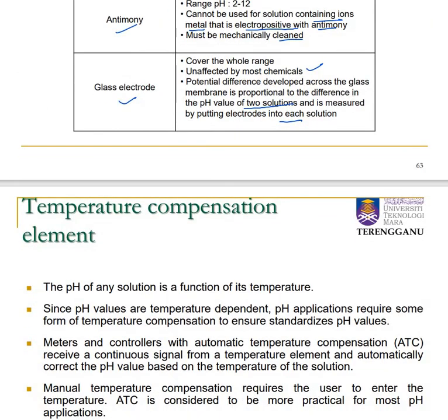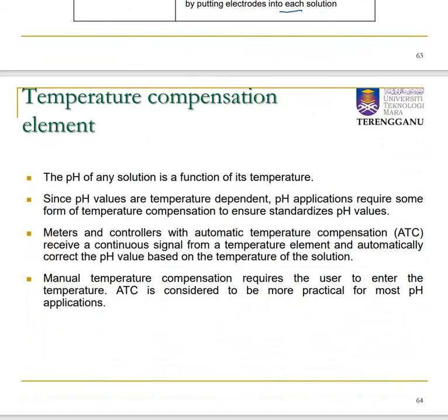Okay, with the other type of pH device, we can use a temperature compensation element. For your information, pH is a function of temperature. pH is temperature dependent. So pH applications require some form of temperature compensation to ensure a standardized pH value.